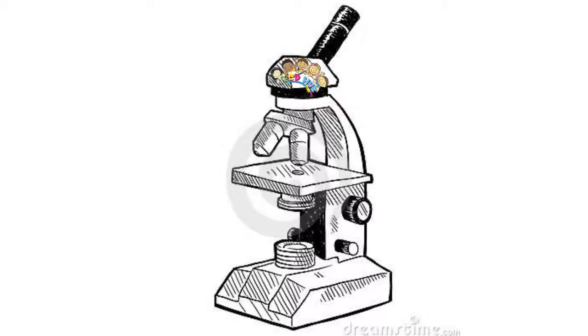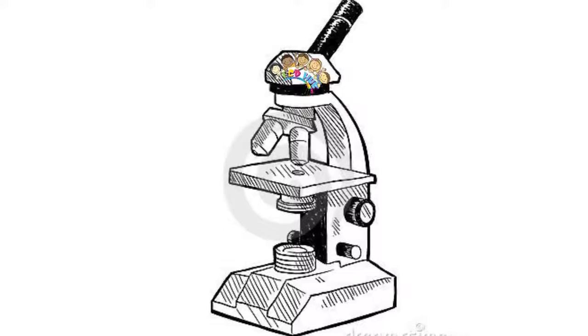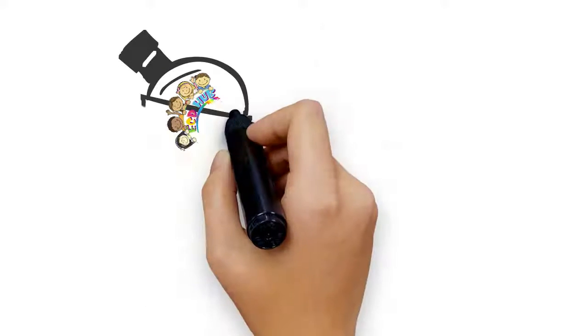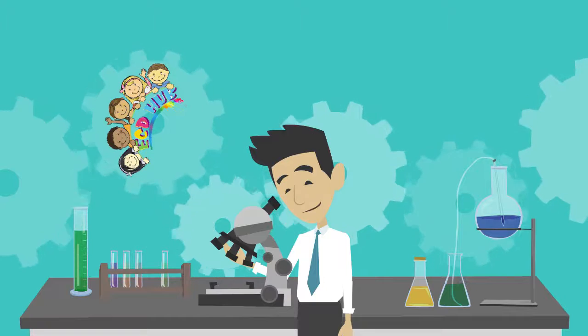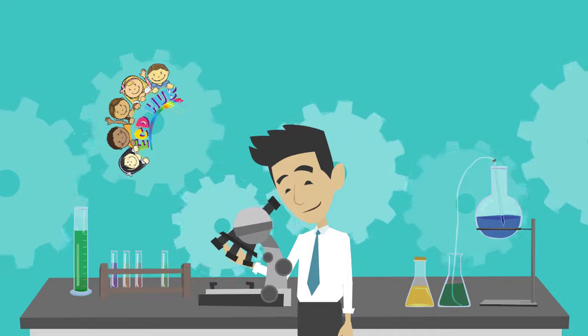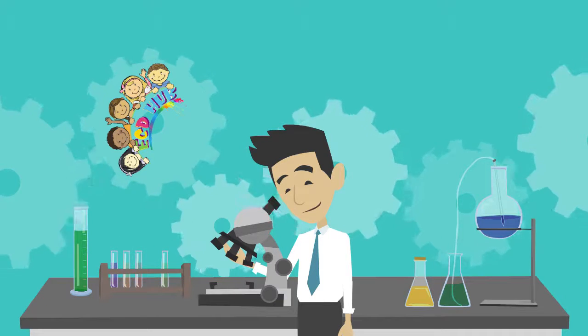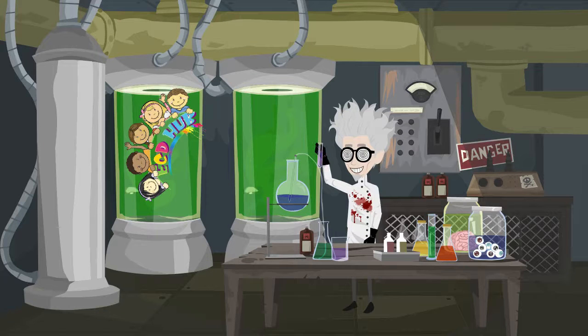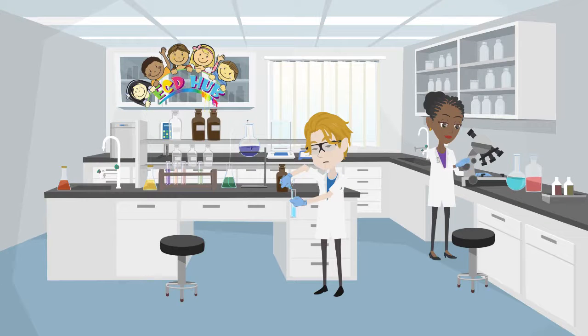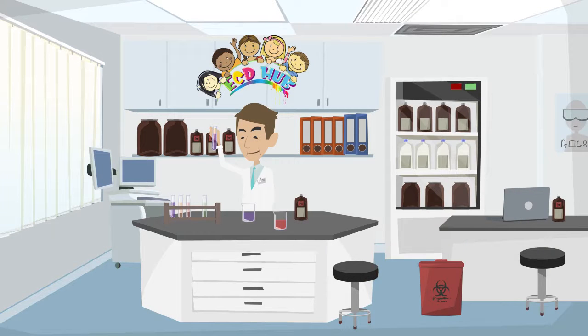If you look into a pond, you may see a few living things like fish, or lily pads, or maybe even some frogs. But if you were to scoop a sample of that water and view it with a microscope, you would see thousands of microscopic life. Microscopic life is anything that is living that can be viewed only with a microscope, things like Daphnia, amoeba or paramecium. This lesson will look at the parts of a microscope so you can learn how to view this tiny world.